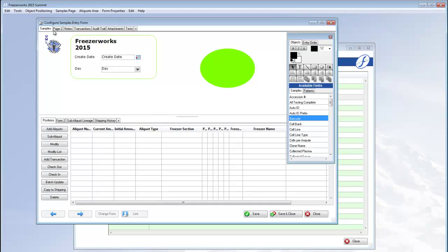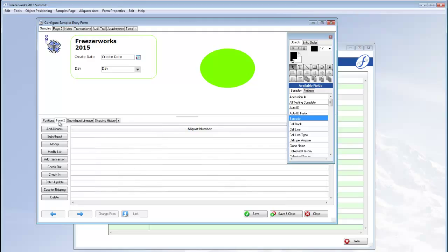A samples form can have many samples pages, which can have many aliquots forms, which can have many aliquots pages. Can't get much clearer, can it?